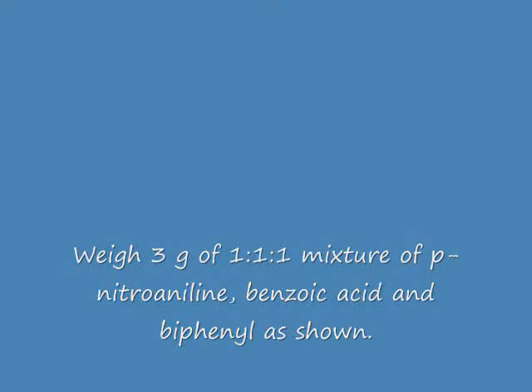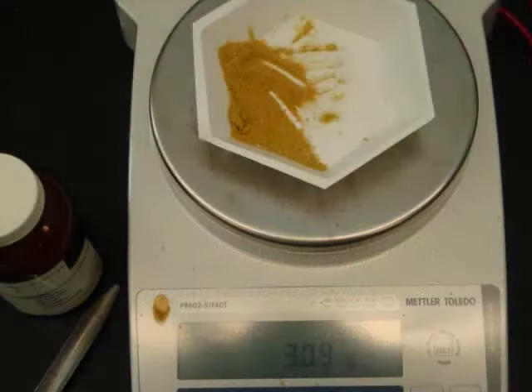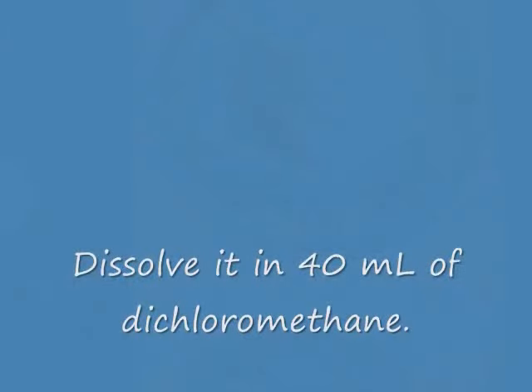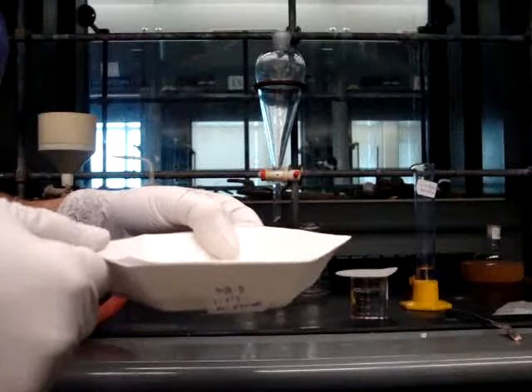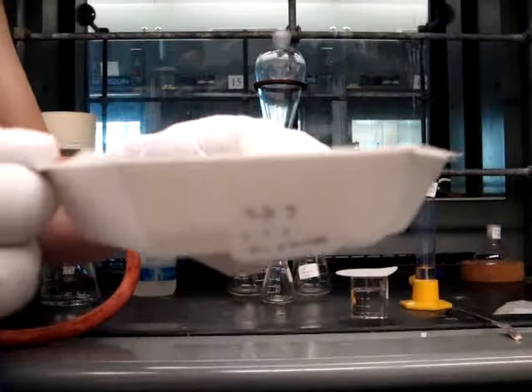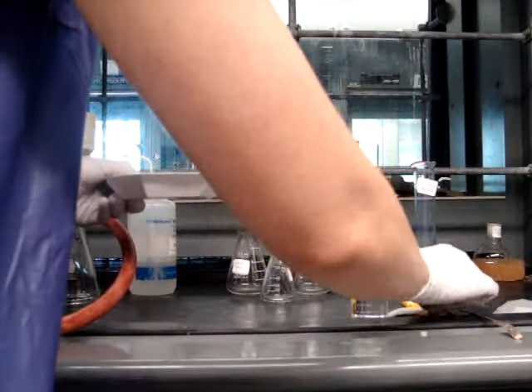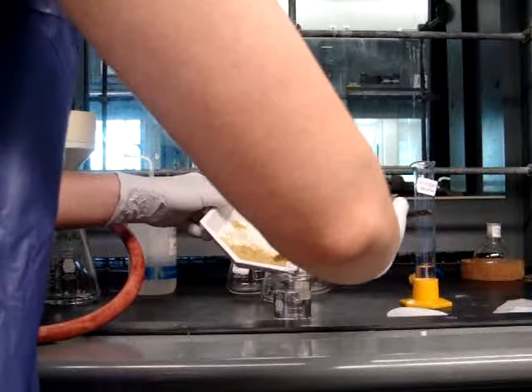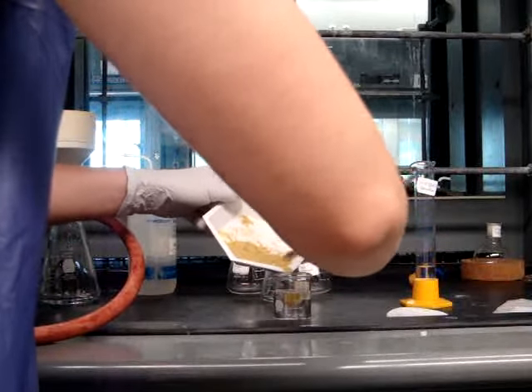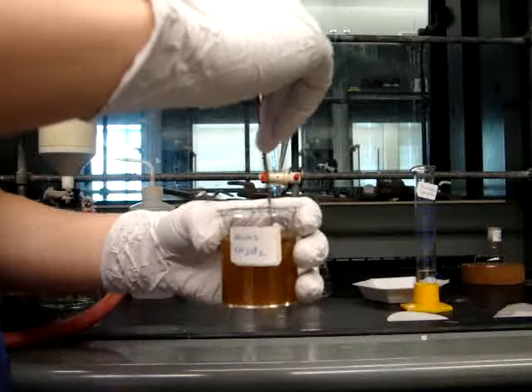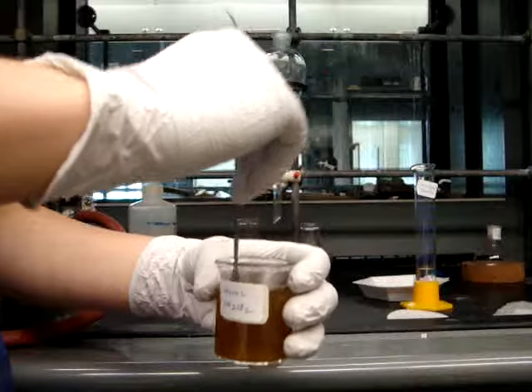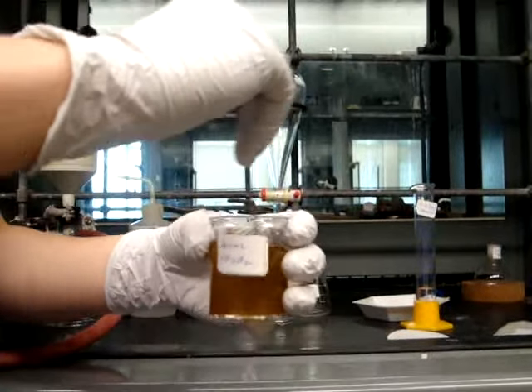Now you've weighed out your 3 grams of your P-nitro-aniline, benzoic acid, and biphenyl mixture. You're going to dissolve this in 40 milliliters of your organic solvent, dichloromethane. Make sure that this compound dissolves completely before you add it into the separatory funnel. If it is not dissolving completely, add more organic solvent.